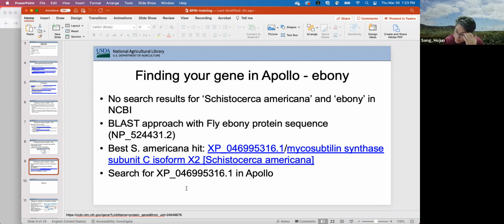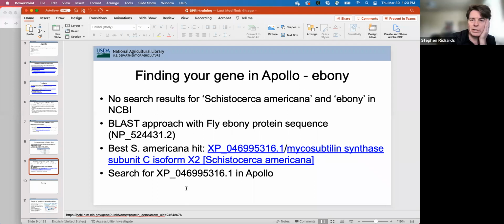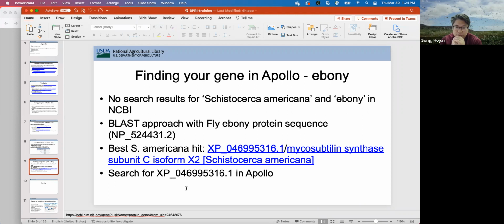Is it worth putting in a track for Daphnia proteins? I haven't kept up with the quality of the Daphnia assembly. The ones that I'm familiar with were from the first generation, or even before then. Yeah, me too. The quality was just not what we would expect and want nowadays. And therefore the assembly quality, and so the annotation quality, we can expect to be subpar as well. So yeah, fly might still be better.